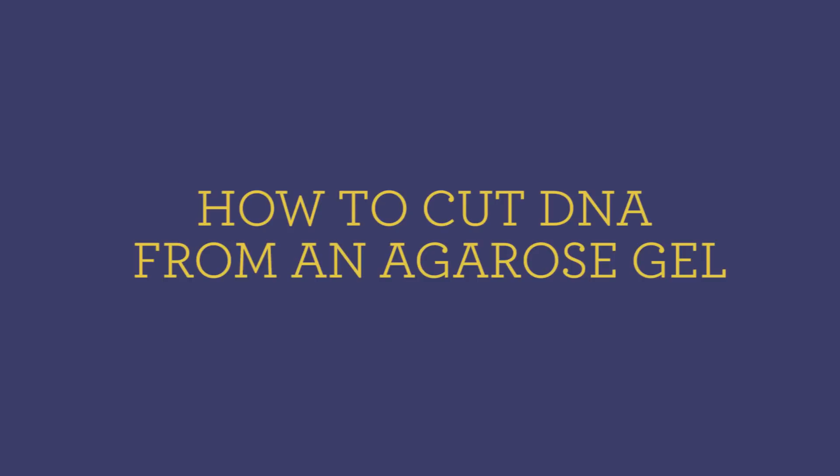Hi everybody! Welcome back to Synthetic Biology 1. Today I probably look a little bit funny, and that is because we are using our special DNA cam that is equipped with optical filters that will allow you at home to visualize the fragments of fluorescently labeled DNA that we're going to be working with. Today I will show you how to cut bands of DNA out of an agarose gel for purposes of purification. So let's get started.